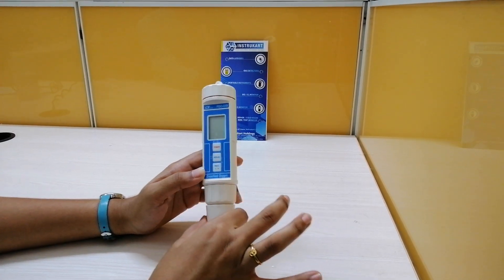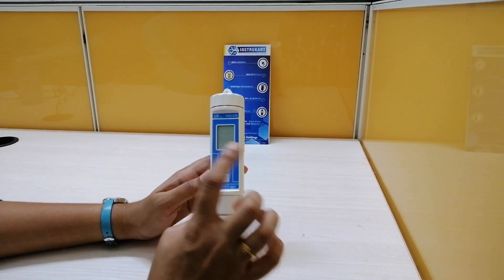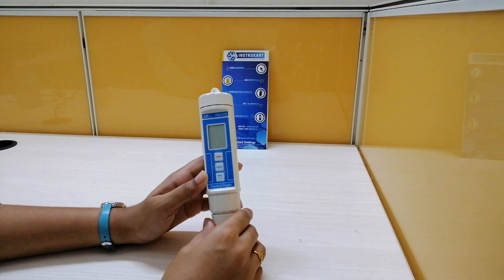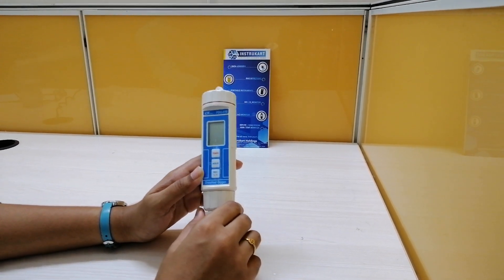Coming to the technical specifications of this particular product, the measuring range of dissolved oxygen is from 0 to 20 mg per litre. And for oxygen in air, it is 0 to 100%, and for temperature it is 0 to 50 degrees centigrade.